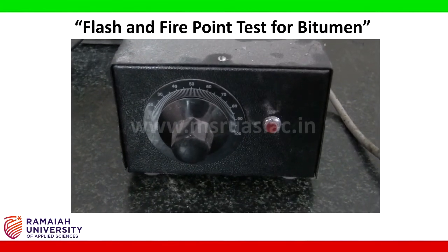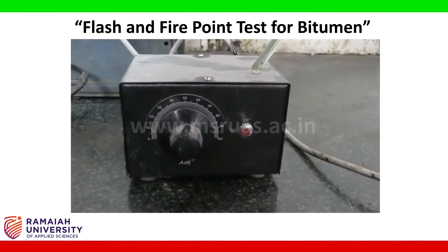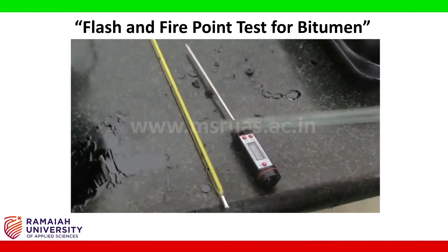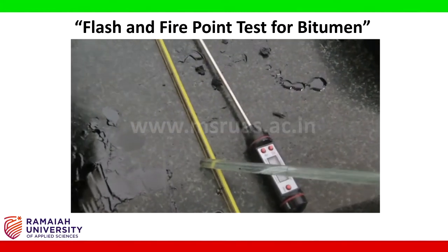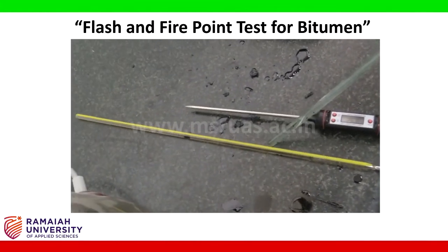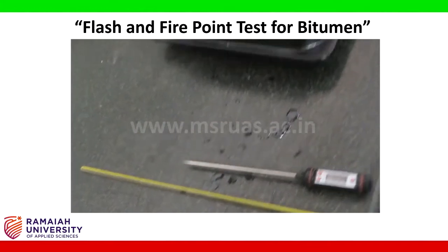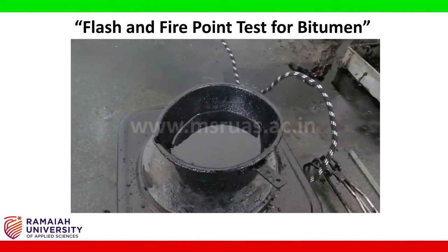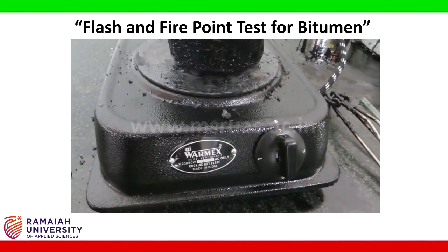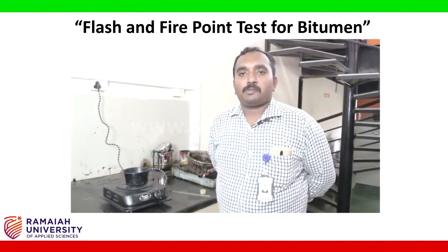Next, you may use a digital thermometer as well as a thermometer up to 300 or 400 degree centigrade measurement. Both can be used. You want the bitumen and also the hot plate. Now let's start the experiment.